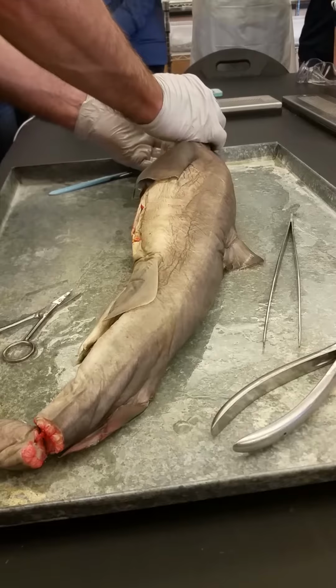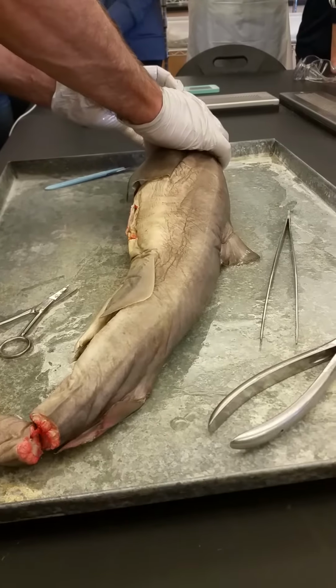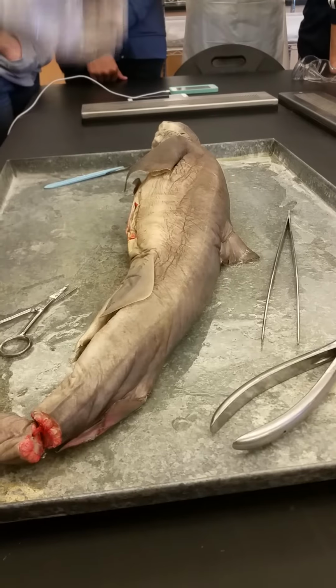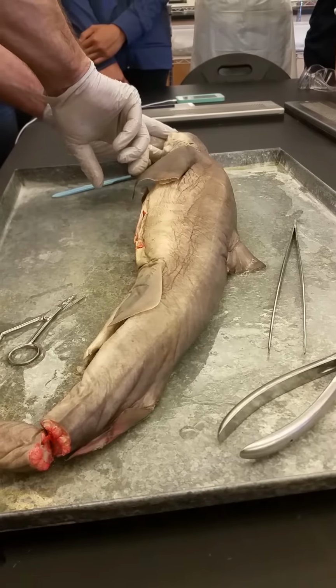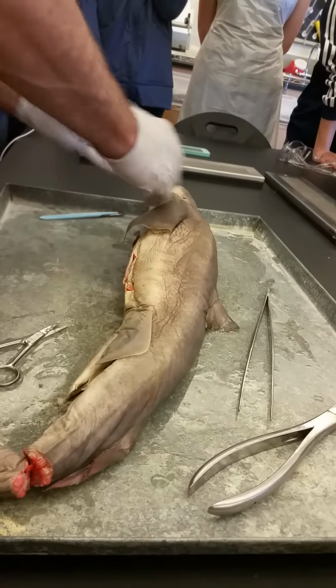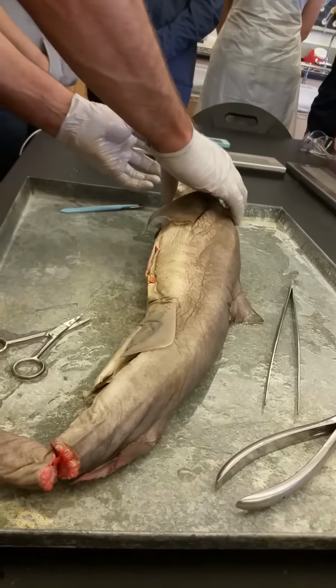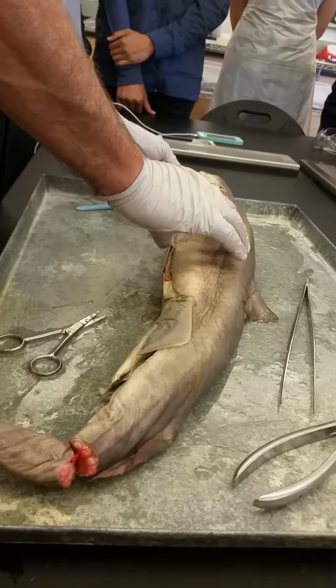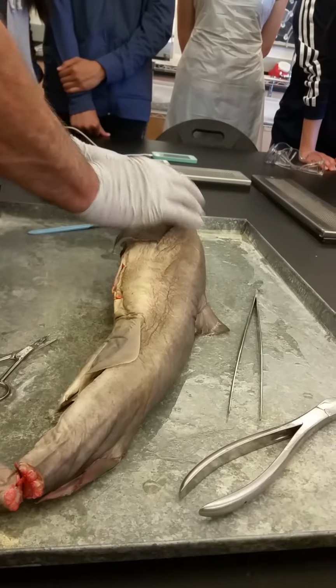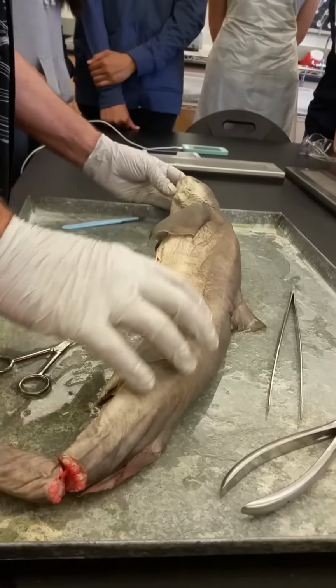So they can feel if something's coming at their eyes. In particular, if they're trying to eat something, they can protect their eyes because they can feel if something's coming at their eyes. Or again, it's hard to see what you're biting down here, but they can feel where it is by their lateral line extension. So by those vibrations in the water, pressure waves in the water, they don't have to see it. They can know exactly where it is and can bite it. Okay, so the lateral line extending onto the head here.